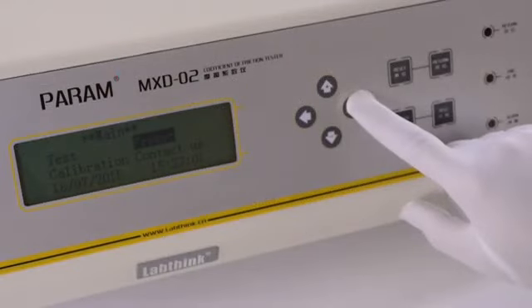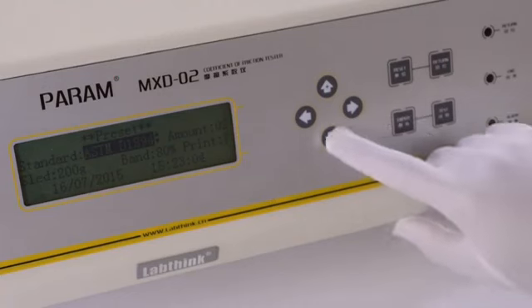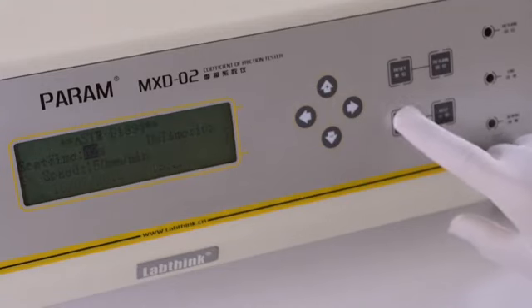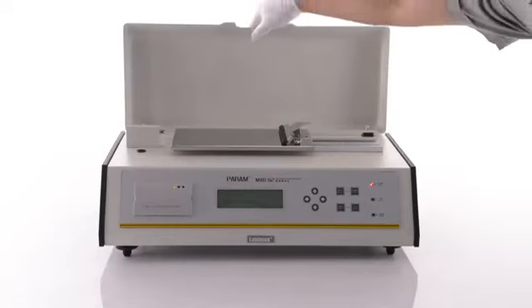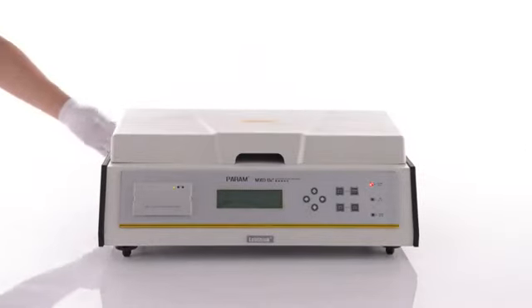Press Enter to enter the preset interface, and press the left and right arrow keys to move the cursor to Standard, and select ASTM D1894. The speed will be 150 mm per minute. Treatment after test. Pull down the dustproof cover. Switch off the instrument.